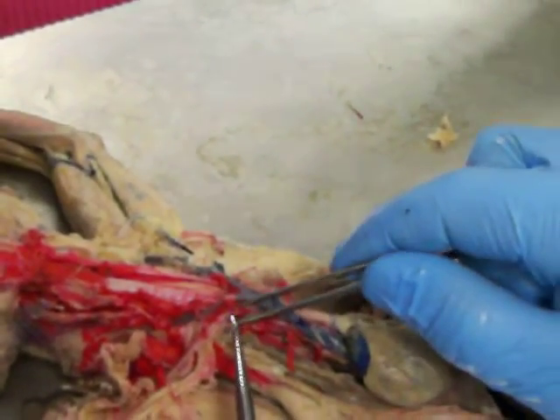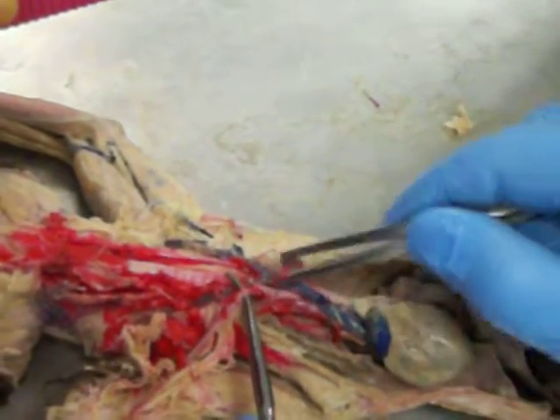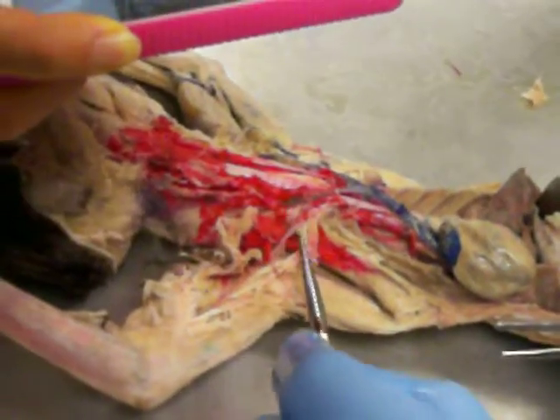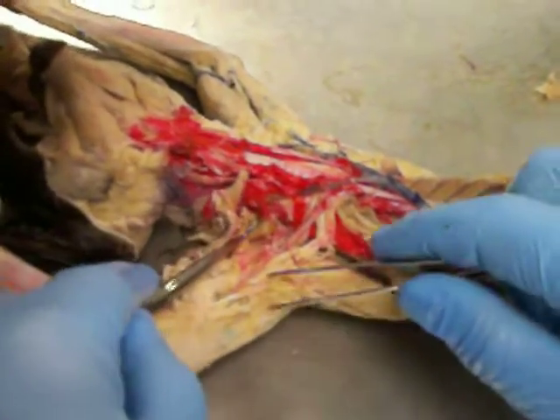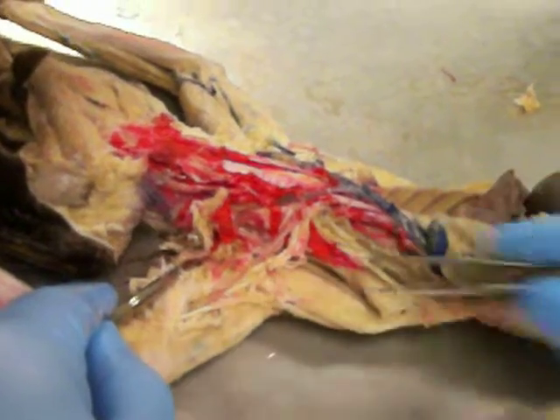which is right here. There's your right subclavian, and you can see the branch right there. Okay, the right subclavian is going to continue out, and when it reaches the axillary region, the armpit, we call it the right axillary artery. And then where it continues further across the arm, we call it the right brachial artery.